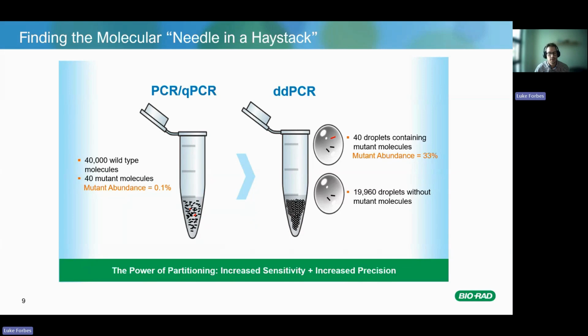So the bottom line is real-time PCR tells you approximately how much by measuring when, and ddPCR tells you exactly how much by counting the individual events. So it removes the estimation-by-comparison step, giving you a direct count, which means ddPCR is really valuable when you're using a precise method, or when you need to know an exact count.